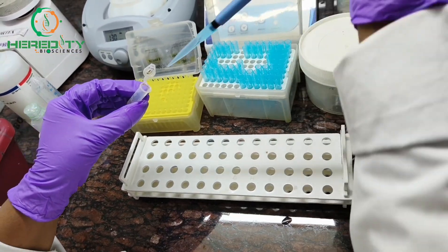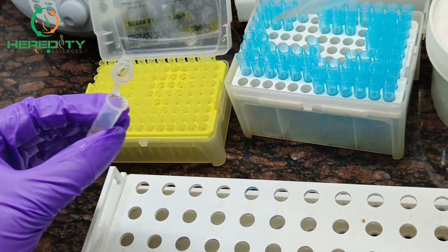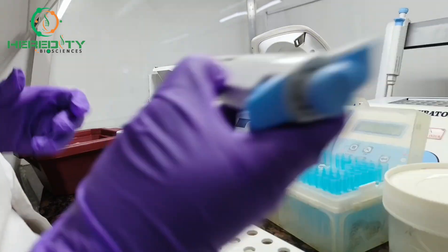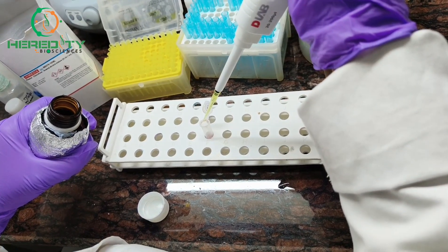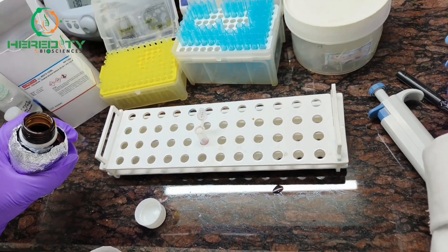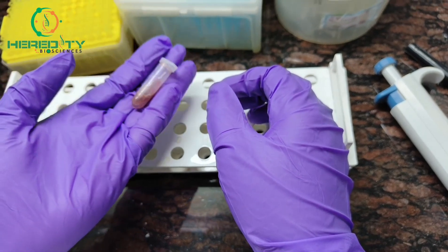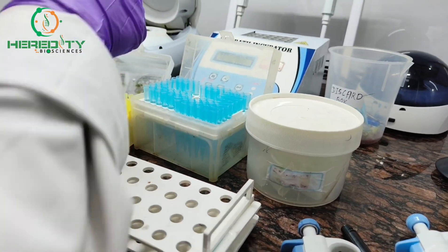Mix it well. After that, add 200 µl of phenol-chloroform isoamyl alcohol. After that, gently mix it by inverting. Now we will centrifuge it at 10,000 rpm for 5 minutes.